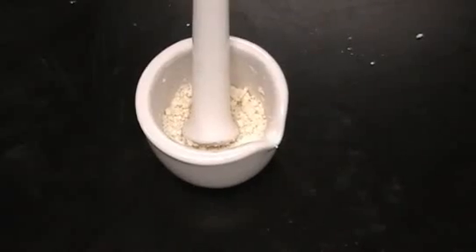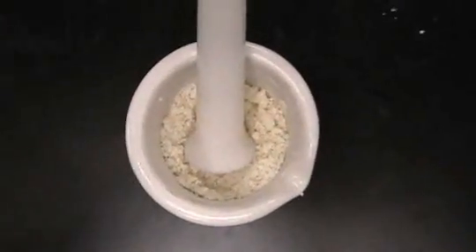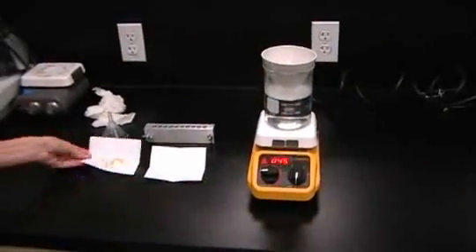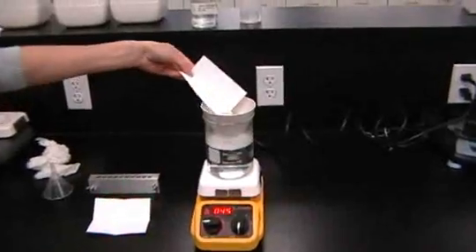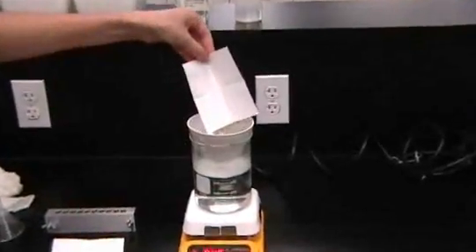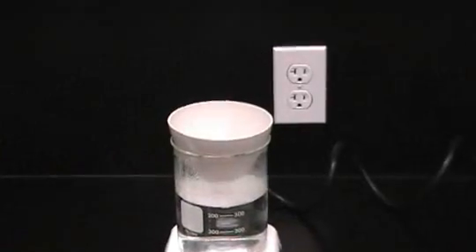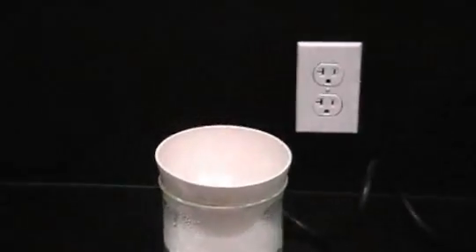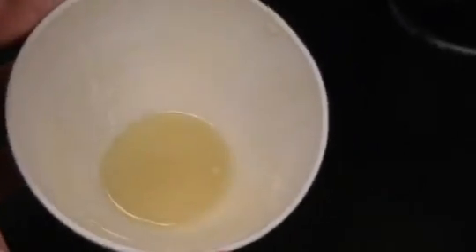First thing, measure out the appropriate amount of cocoa butter and make sure you triturate it into a very small, fine particle size. Take that cocoa butter and you're going to add it into a crucible. Now, the water underneath the crucible for the cocoa butter must be maintained at a temperature of 42 degrees. If it gets higher, make sure you dump a little water out and add cooler water. You don't want to heat your cocoa butter too fast. It needs to be heated very slowly so it maintains a milky, opaque color.